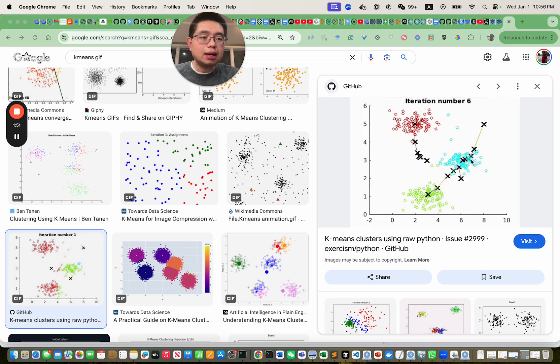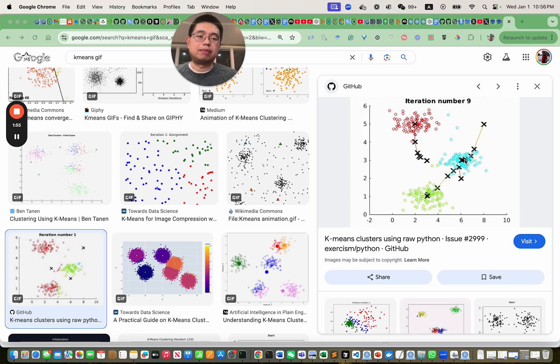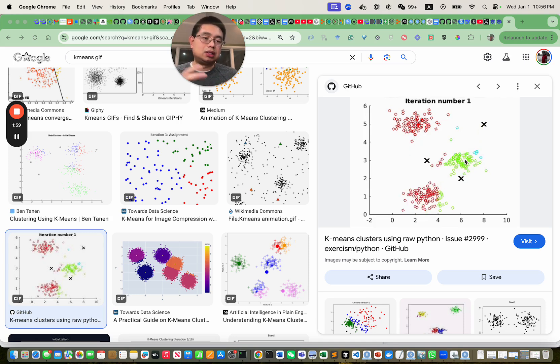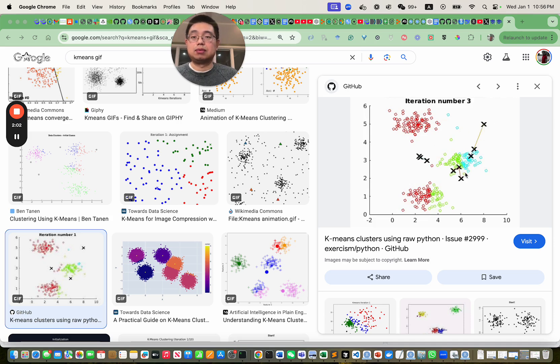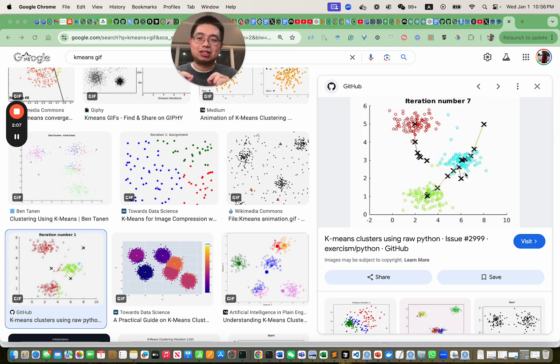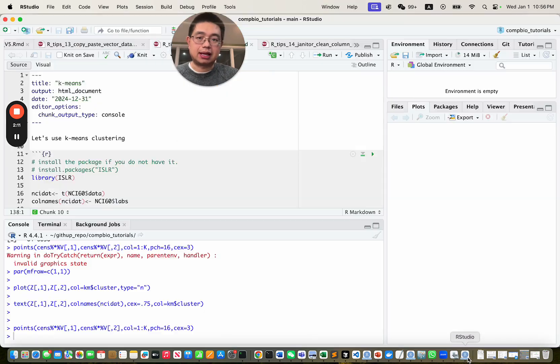There is randomness in k-means clustering, and the result really depends on where you initialize those center points. So to make the analysis more reproducible, you have to use set.seed in R. Let me show you step by step.